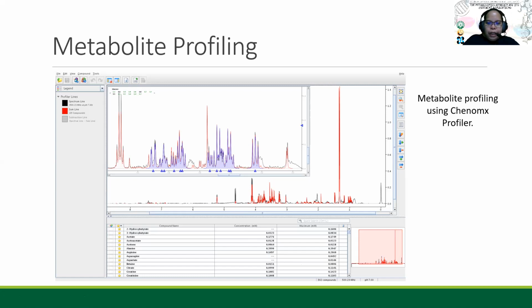So again, you get quantitative data, and it's actually like building a puzzle. So you can match, you try to adjust these peak clusters accordingly. I won't base my quantitation on these peaks because they have different peaks that might also be overlapped with this signal.